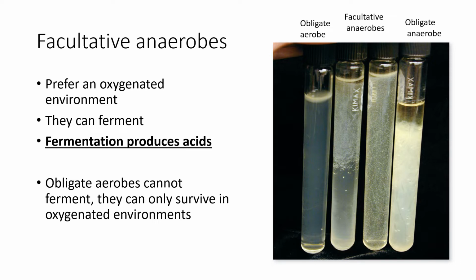All right, so in lecture, we said that the one on the left, this is Staph aureus, and the one on the right is E. coli.